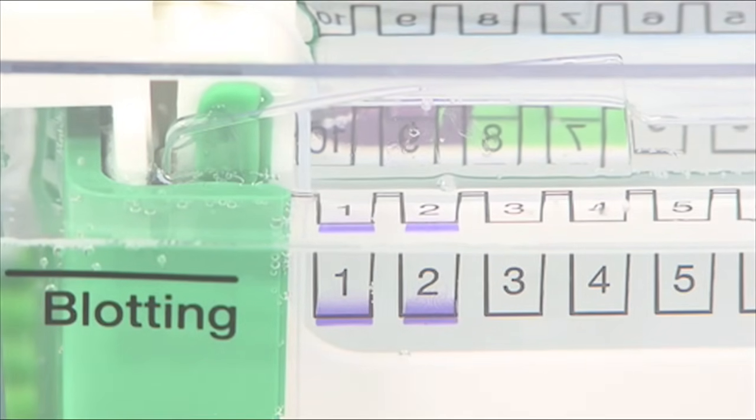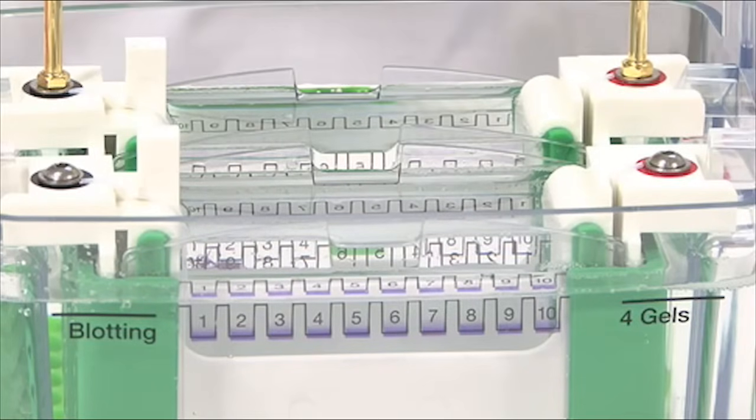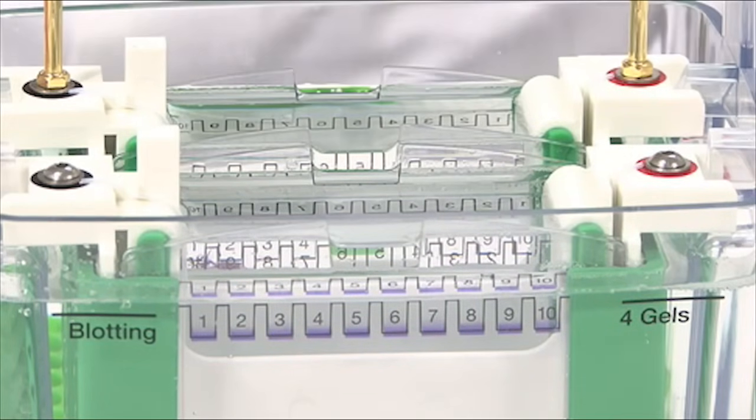Once you have loaded the wells, you are ready to start the electrophoresis run. Place the lid on the TetraTank, making sure to match the colored electrodes on the lid to the electrode posts on the core.